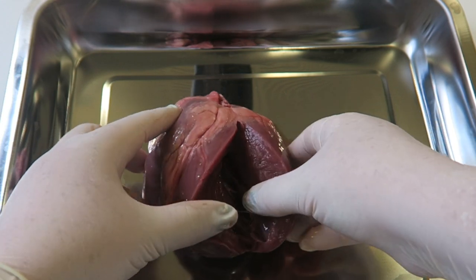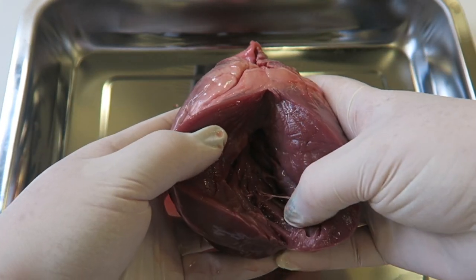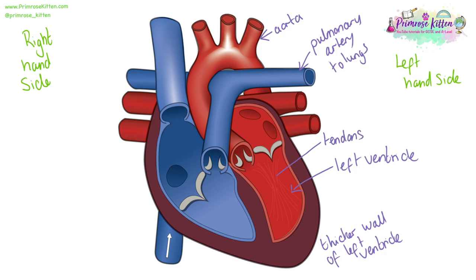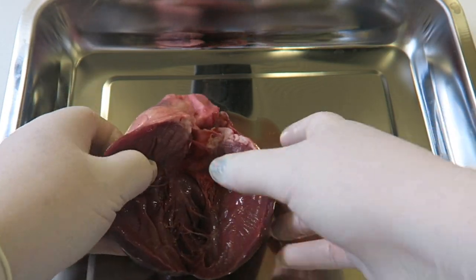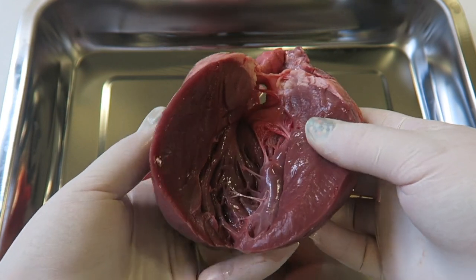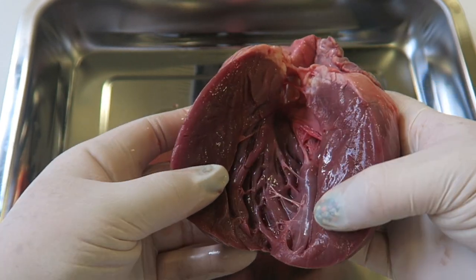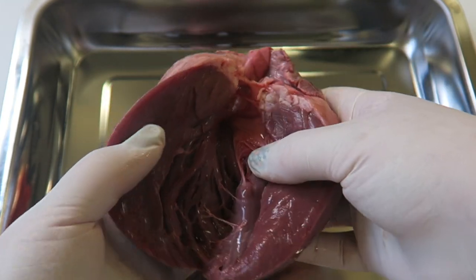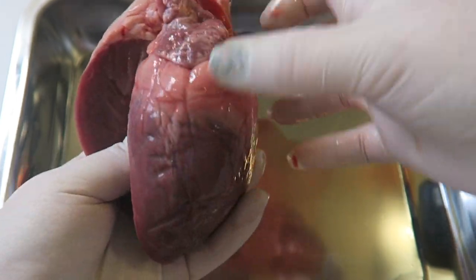So if we open this up, we are now going into, remember this is the left, we're going into the left ventricle down here. And what you can see are these tendons. Just going to extend that up a bit. We've now got the left side of the heart totally opened up. What I want you to notice is the thickness of this muscle here. It takes up the majority of the space. It's because this muscle is going to be pumping from the left ventricle down here around to the rest of the body. And it's going to be pumping through this large blood vessel that we saw at the top.